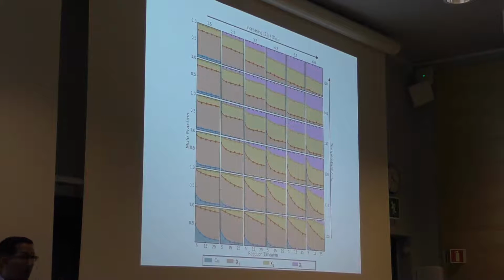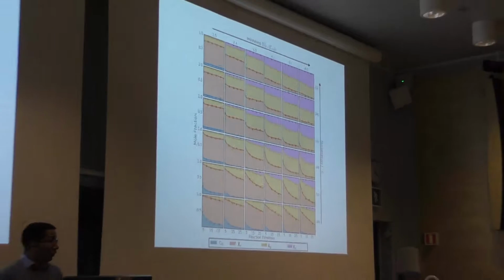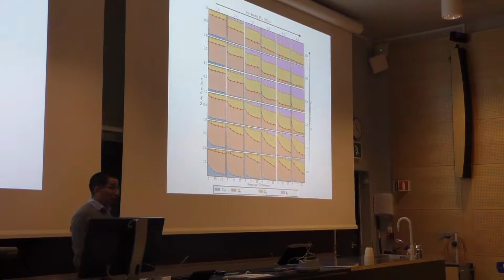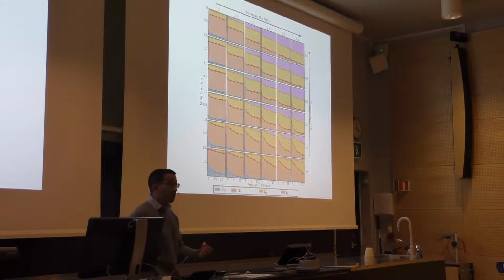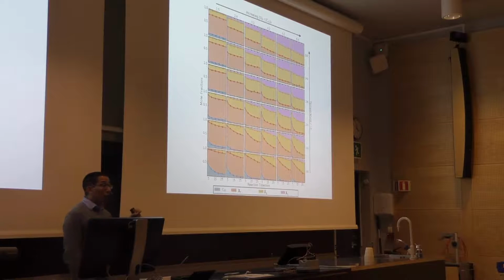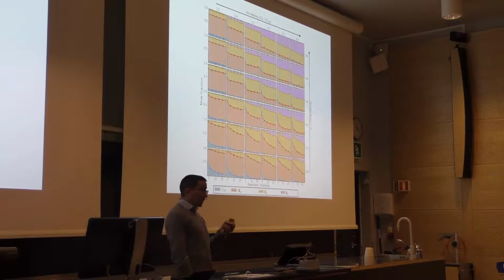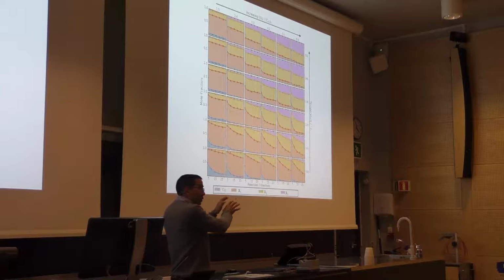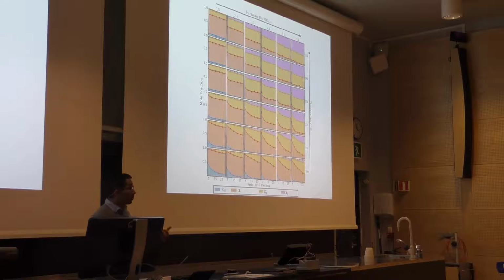So this is the point at which Bjorn's earlier point absolutely holds true, which is if you try to push this kind of approach too far, you just run out of time. And when you run out of material, you can't do the number of measurements you want to get a good quality optimization. So here, this is where you rely on the algorithms that I was talking about earlier. If you can choose an algorithm that essentially sniffs out the optima and focuses its attention primarily in where it knows good results are likely to be found, you can find the optima much more efficiently, and you can do that at a higher resolution than this kind of linear searching will give you.